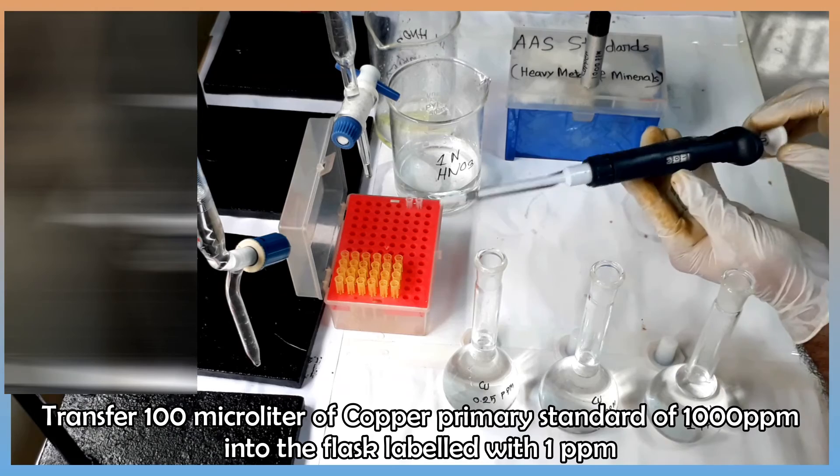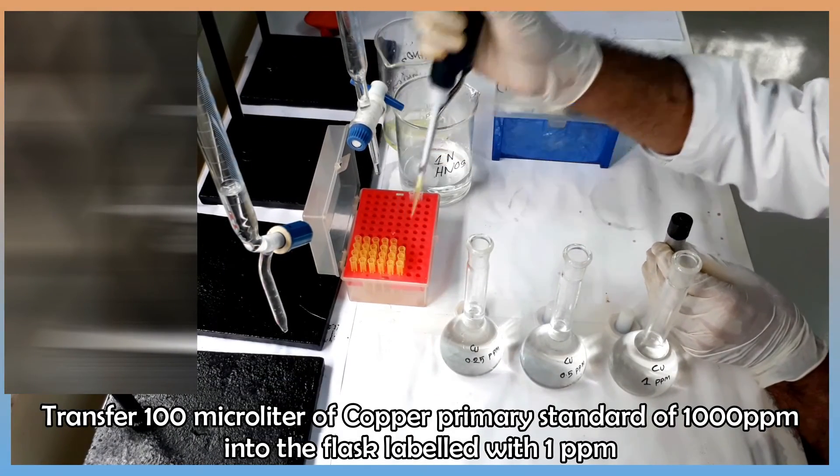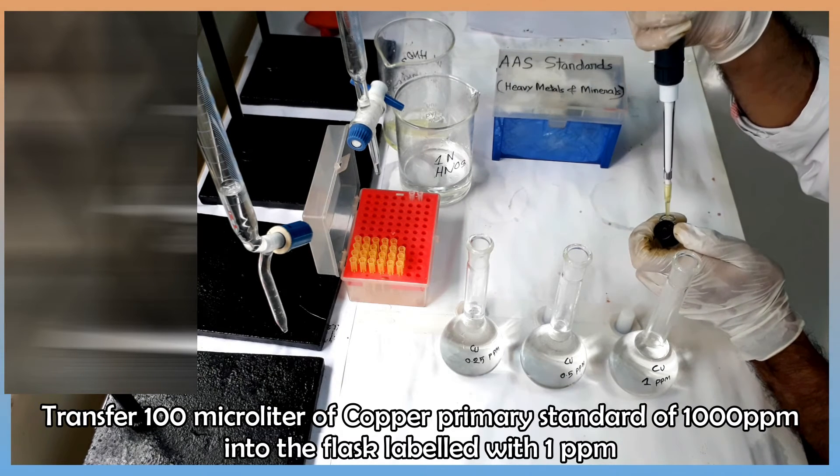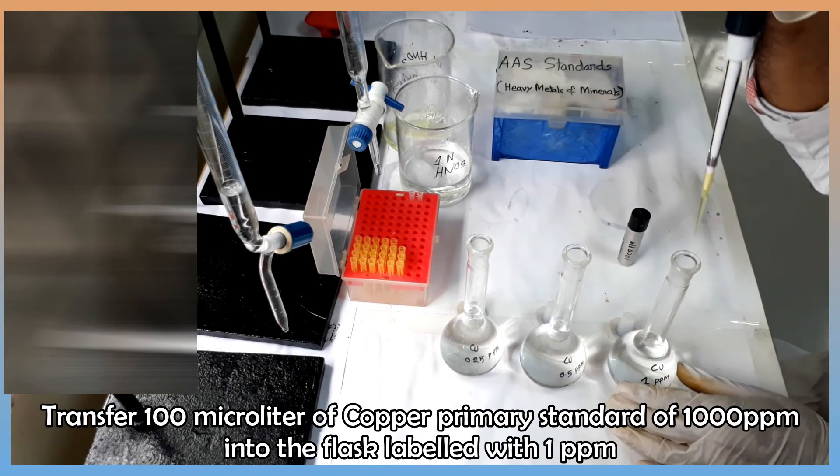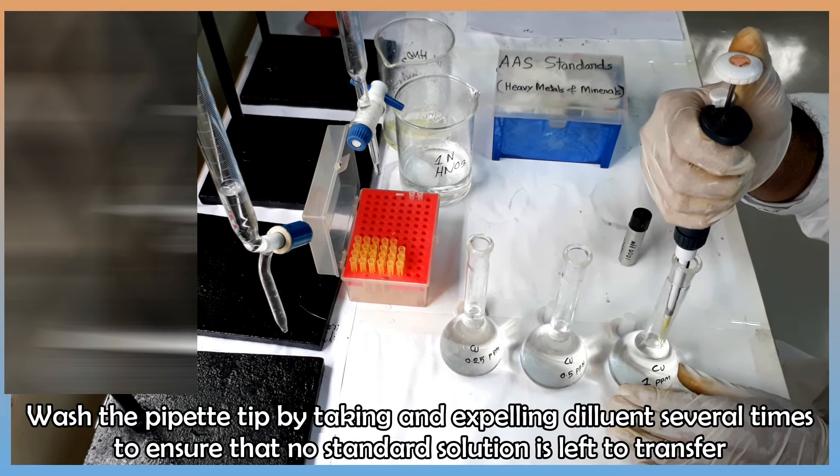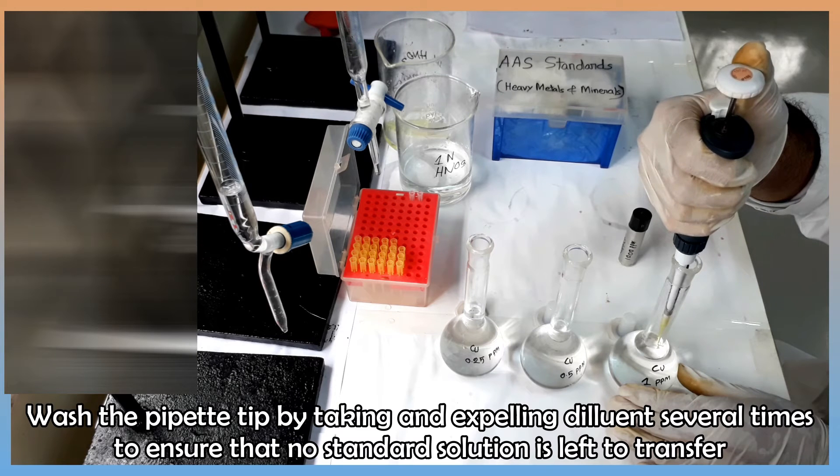Set the micropipette at 100 µL. Attach a new tip and carefully transfer 100 µL of copper primary standard to the flask. Rinse the tip with diluent to ensure that no standard is left on the inner surface of the tip.